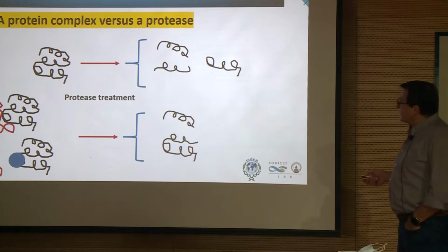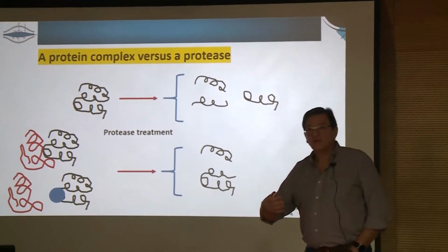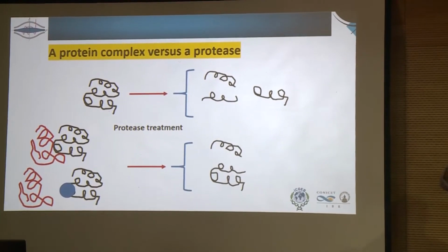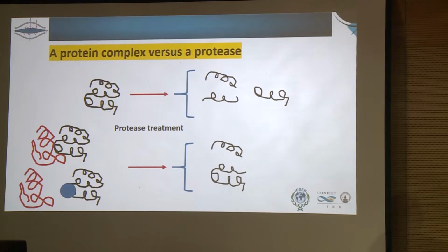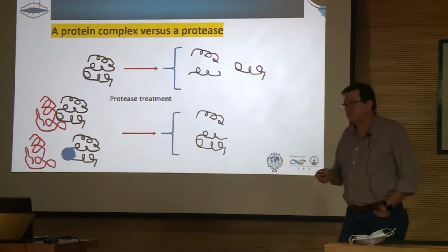So what happens if we have some kind of disrupting event, if we add something to the protein? As a matter of fact, this technique was applied something like 30 or 40 years ago. It was heavily applied at one time, then became a technique applied sometimes in some works, mainly with pure proteins.